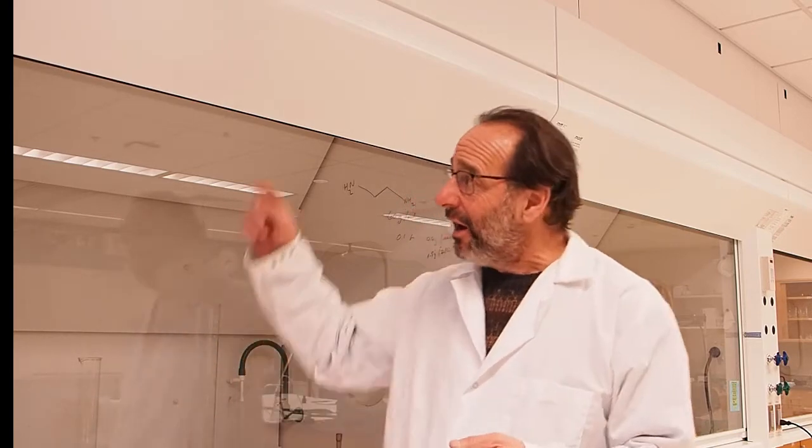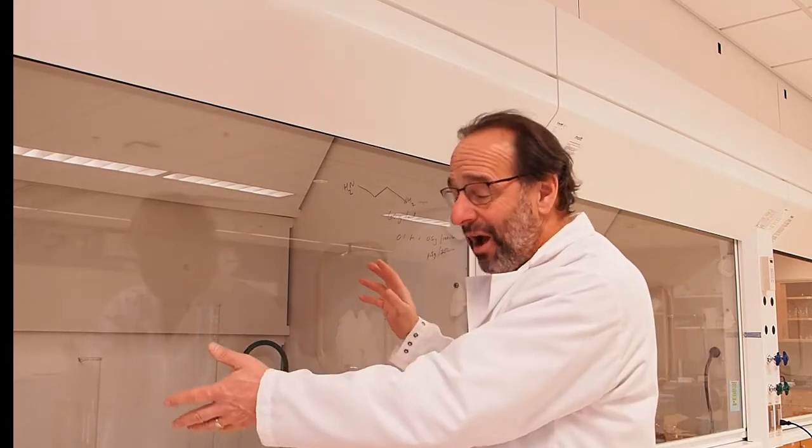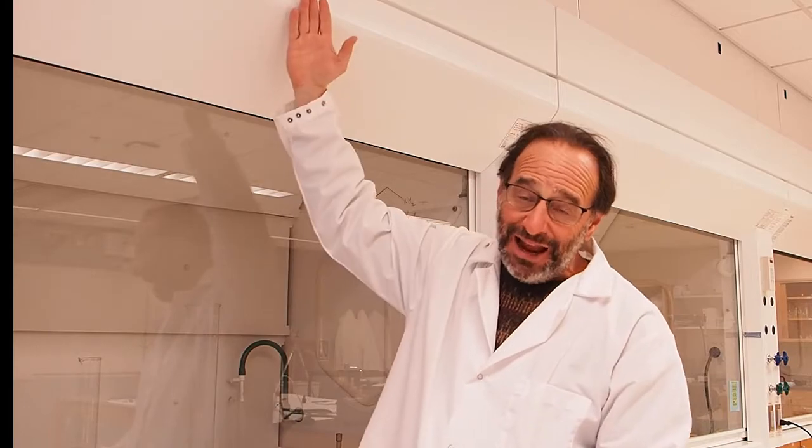Some examples of this are concentrated hydrochloric acid, or concentrated sulfuric acid, or concentrated ammonia that you want to not breathe. And so what we have for that is we have fume hoods. Fume hoods are essentially safety cabinets where air comes in from outside and circulates in this box and then is drawn back outside.